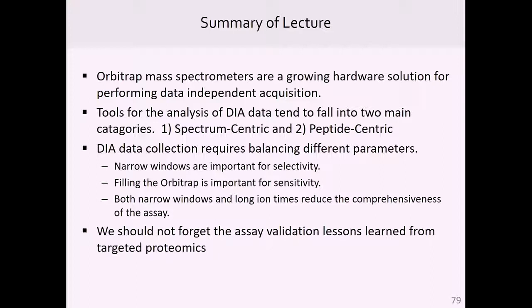DIA data collection requires balancing different parameters. Narrow windows are important for selectivity. Filling the Orbitrap is important for sensitivity. Both narrow windows and long ion times reduce the comprehensiveness of the assay.